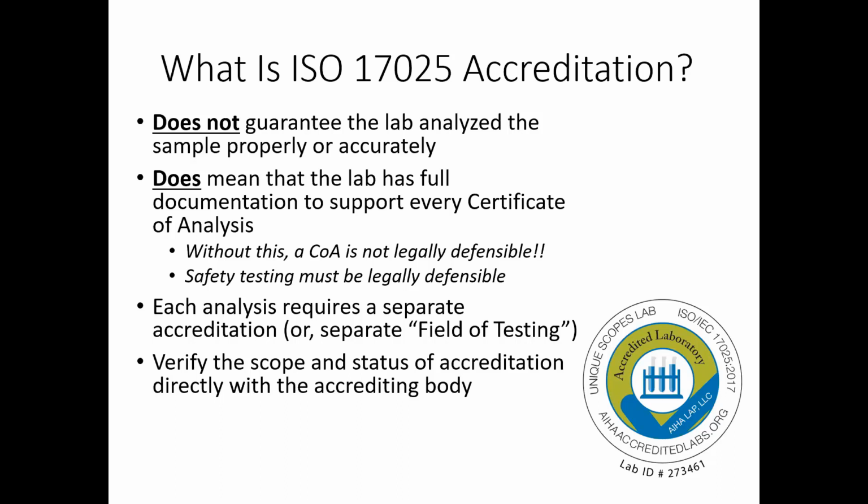The bottom line with ISO 17025, you're going to see this become more and more required from labs. It's definitely a good thing, but it does not guarantee that anybody did anything right. What it guarantees is that we wrote down what we did, and we have documentation all the way to the beginning. So you'll see the chain of custody and that kind of thing when you're submitting samples. That's really the start of the tracking of your sample, when it changed hands and between whom, and showing that there was no swap-out or contamination in the middle.